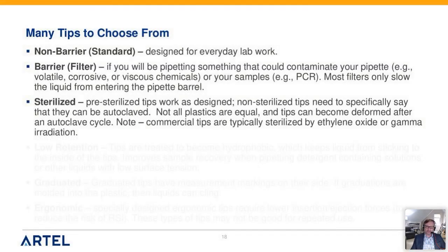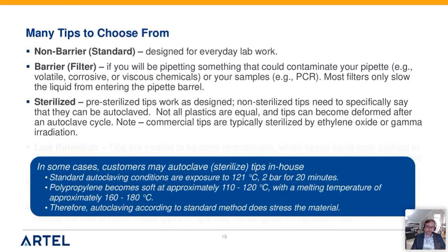Another common one is the sterilization of these tips. So these are pre-sterilized. They're designed for cell work typically, and commercial tips, if they're pre-sterilized, they're designed for this. And I do want to bring up one thing here. I see a lot of labs, especially during the shortage, or even not, they'll buy tips and then they'll do a sterilization in house.